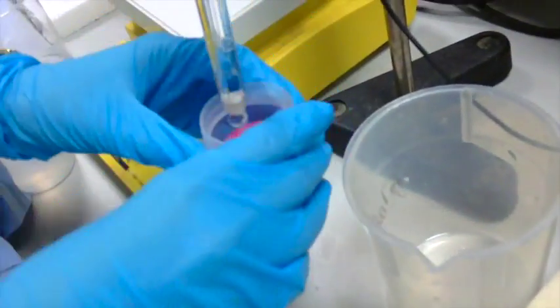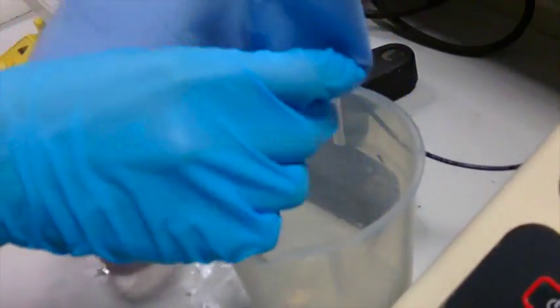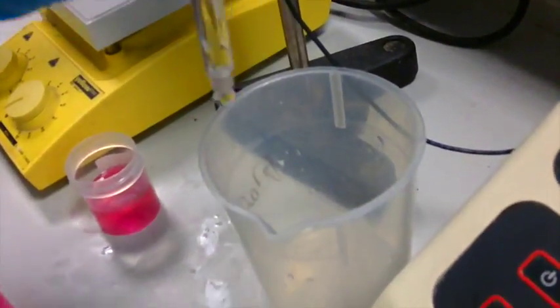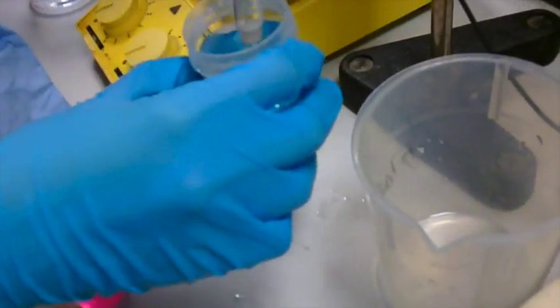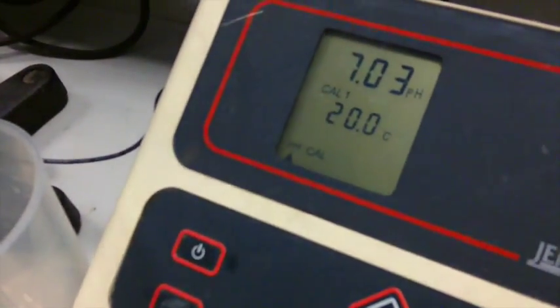After this, the probe is then washed briefly with water again to remove any excess fluid and dried briefly with tissue. It is then inserted into the pH 7 solution, where it is then calibrated for pH 7.